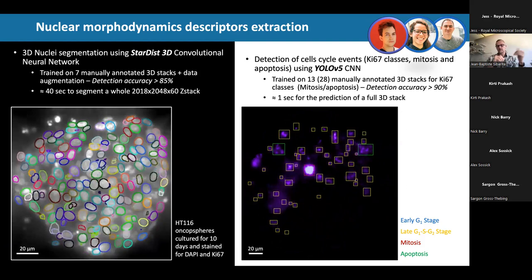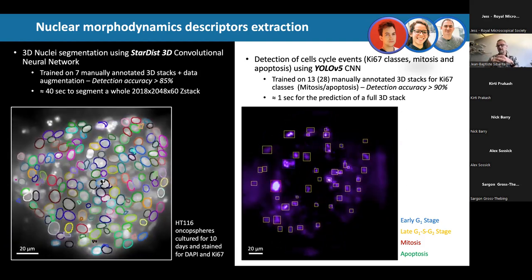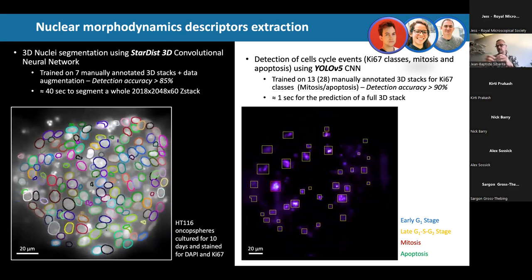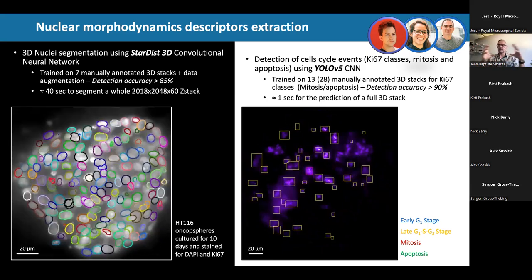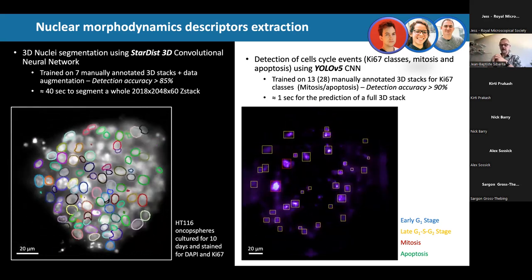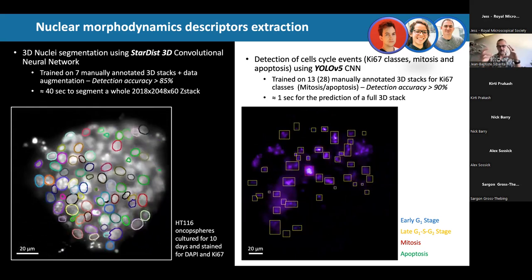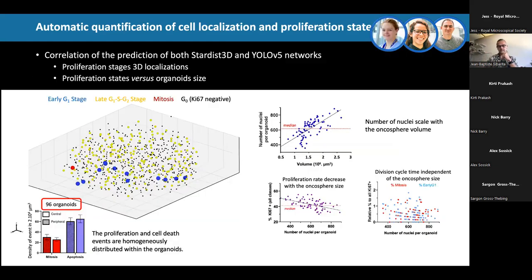Okay, so if I put a drug at different concentrations, I have the capability to collect the data and see how it affects the size and the nuclei morphology, but also the capability of the system to divide, to die, and so on, and to make this 3D structure. That's really what we are investigating now, and it's making very interesting progress. And I think we are close to being able to put that in the whole pipeline.